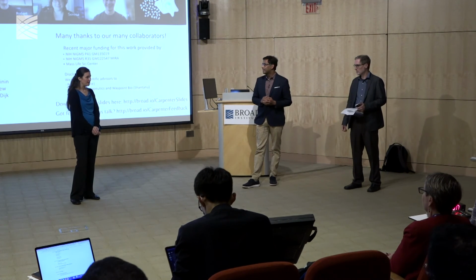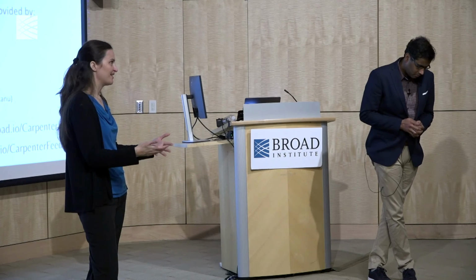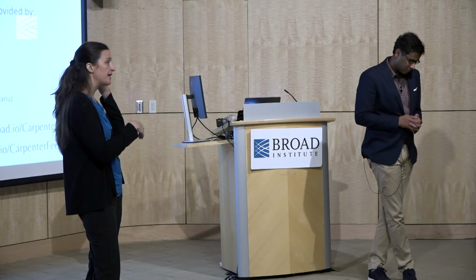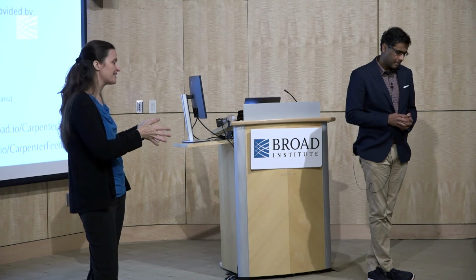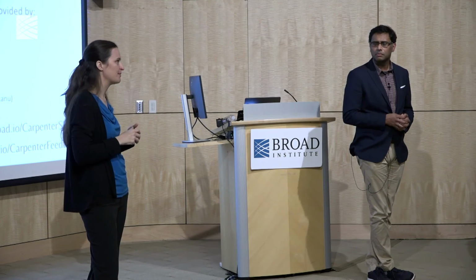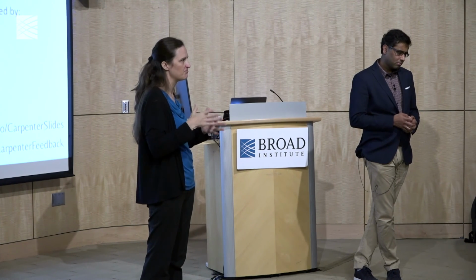And I will say the culture has changed quite a lot. At the very beginning, interpretability was the most important thing to all the biologists we worked with. So we'd say, ooh, we found that your disease or your gene or your drug does something to cells. And their first question is, what does it do to the cells? And they really wanted to understand what the mechanism is. But as we've gone on and had some more machine learning intensive applications where we just say, oh, well, there's some information in this image that predicts the readout in this other assay, we don't really care what it is. As long as we predict this outcome in this assay we care about, then we're good to go. So interpretability has become a little less important as people have adopted the idea of using this as a quantitative data source.